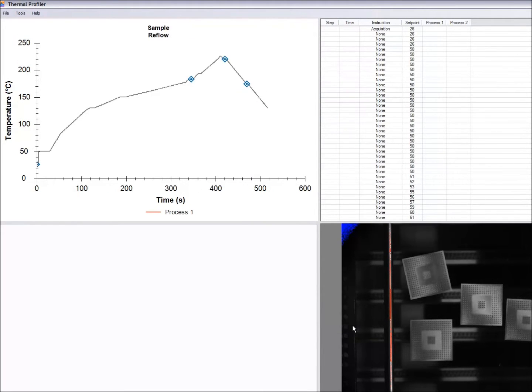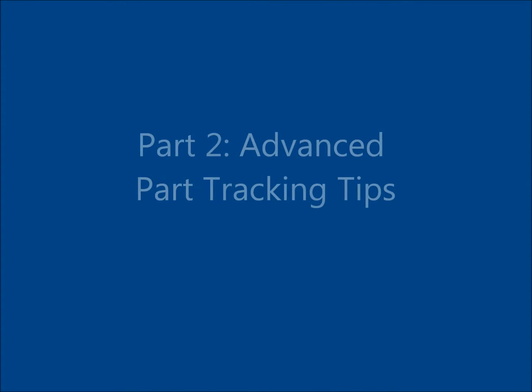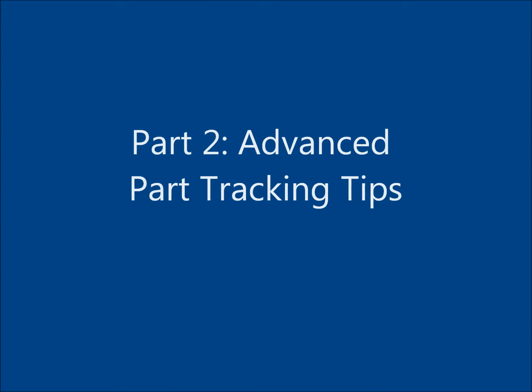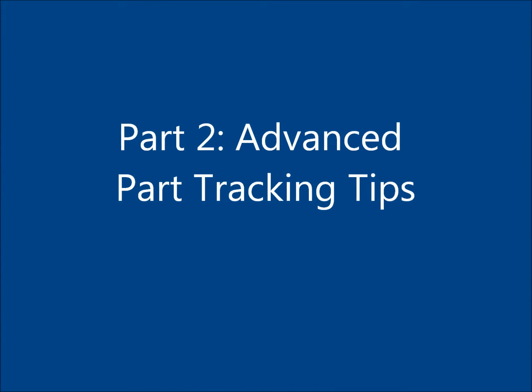Again, thermal profiler will prompt the user on the number of parts found before starting the thermal profile. Studio users should now have a good idea as to how part tracking functions, but before using the software, there are a few more advanced details about part tracking that will be helpful to understand.